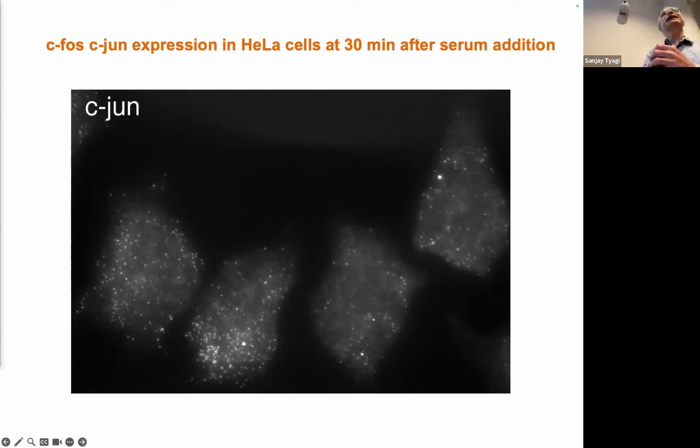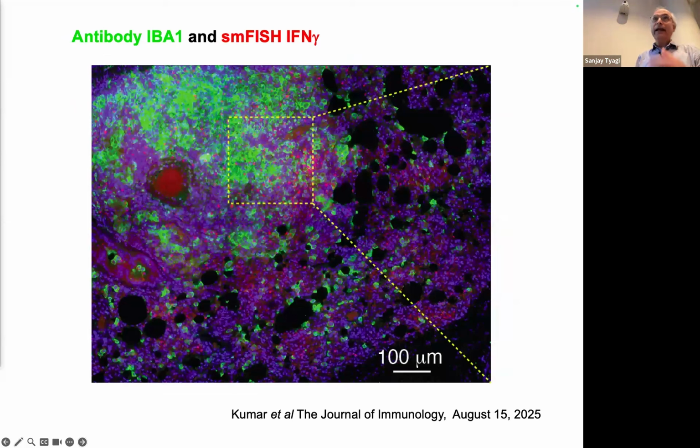And the second big issue is that lung tissue has a lot of autofluorescence. This autofluorescence is dominant in green channels, but it's broad spectrum. It messes up even yellow and to some extent orange channels. So we can only image in red channels. So when we want to use the green channel, we assign it to an antibody. In this case, we had an antibody against a macrophage marker called IBA1, and this IBA1 is expressed on the cell surface.